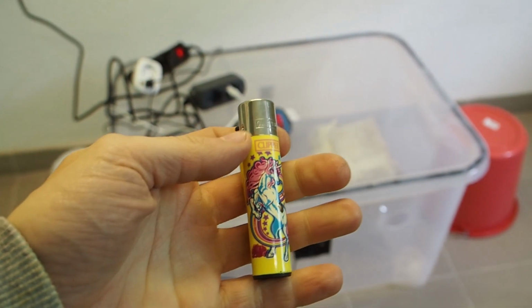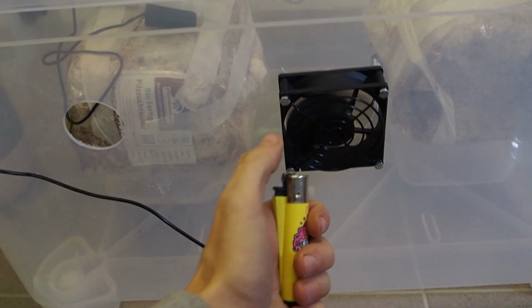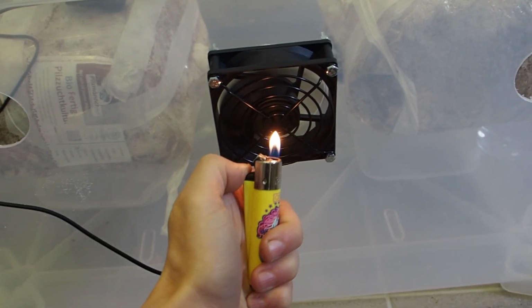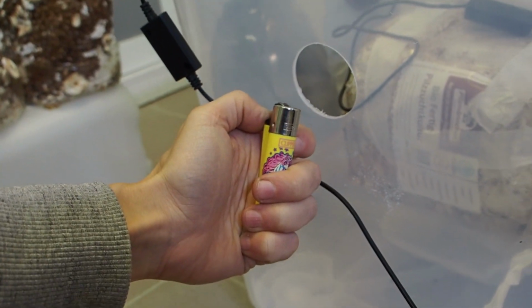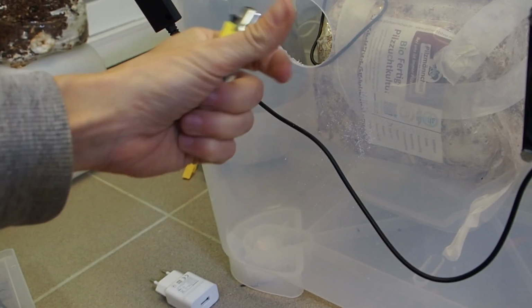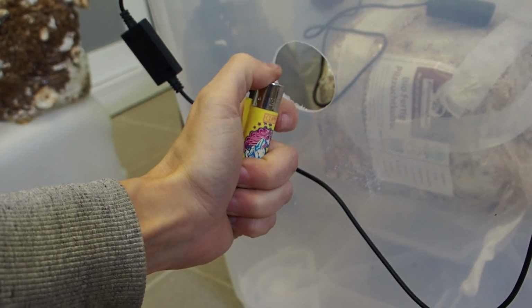Okay, I have this lighter here and now I will show you how the air flows. So here the flame is getting drawn to the fan, and here the air is coming out of the box. It's so strong that even my lighter goes out.